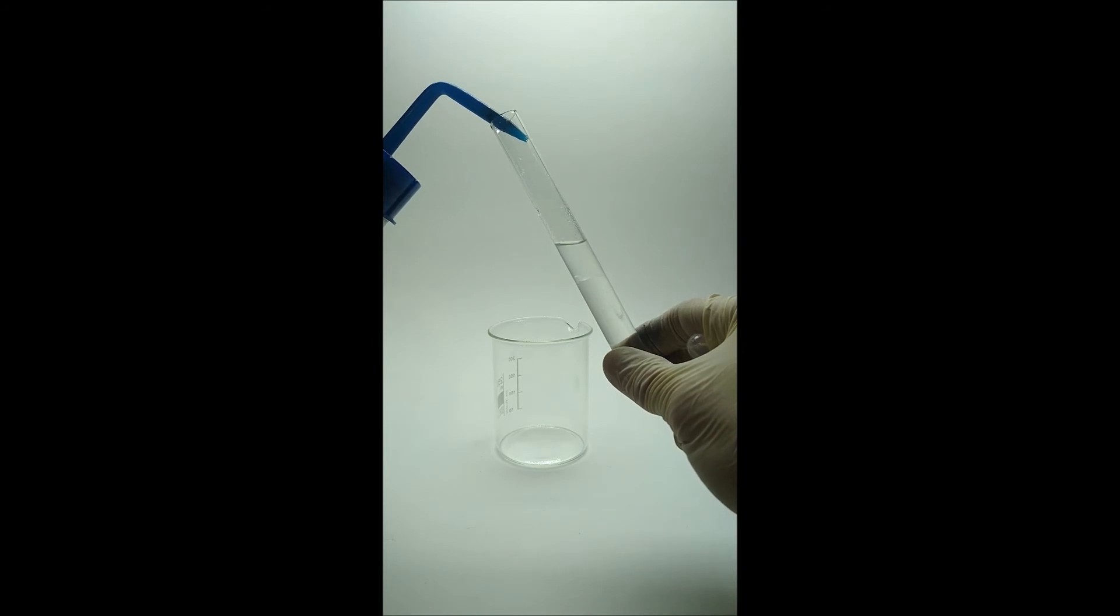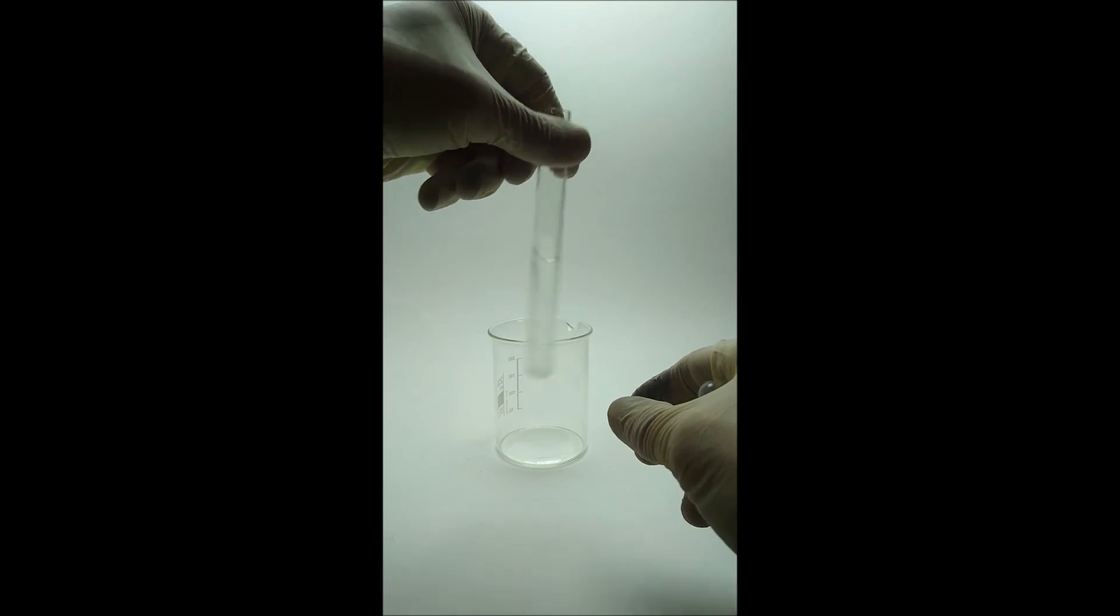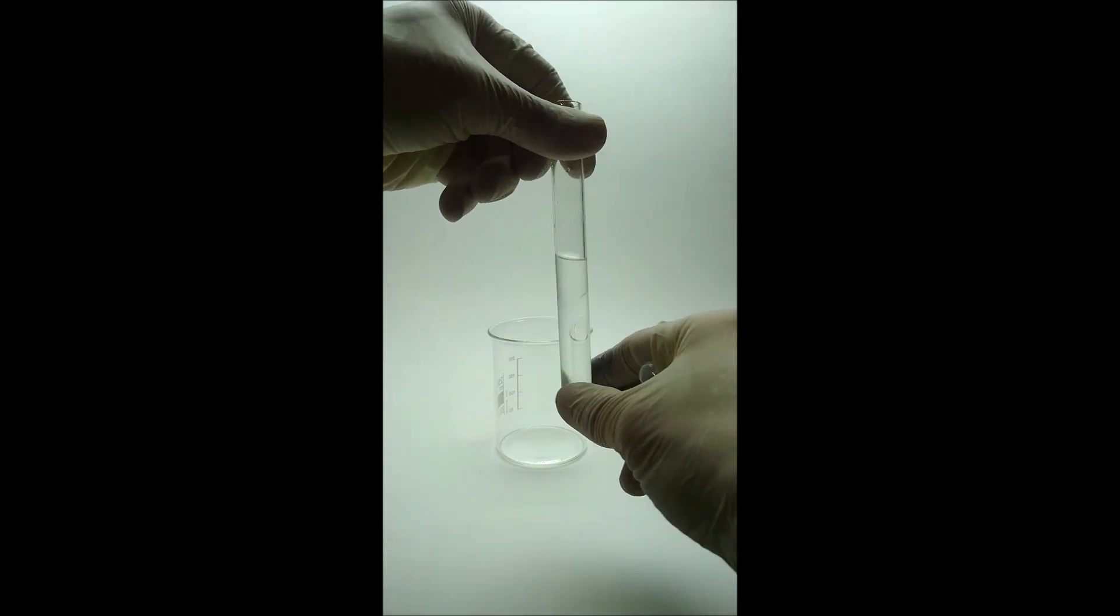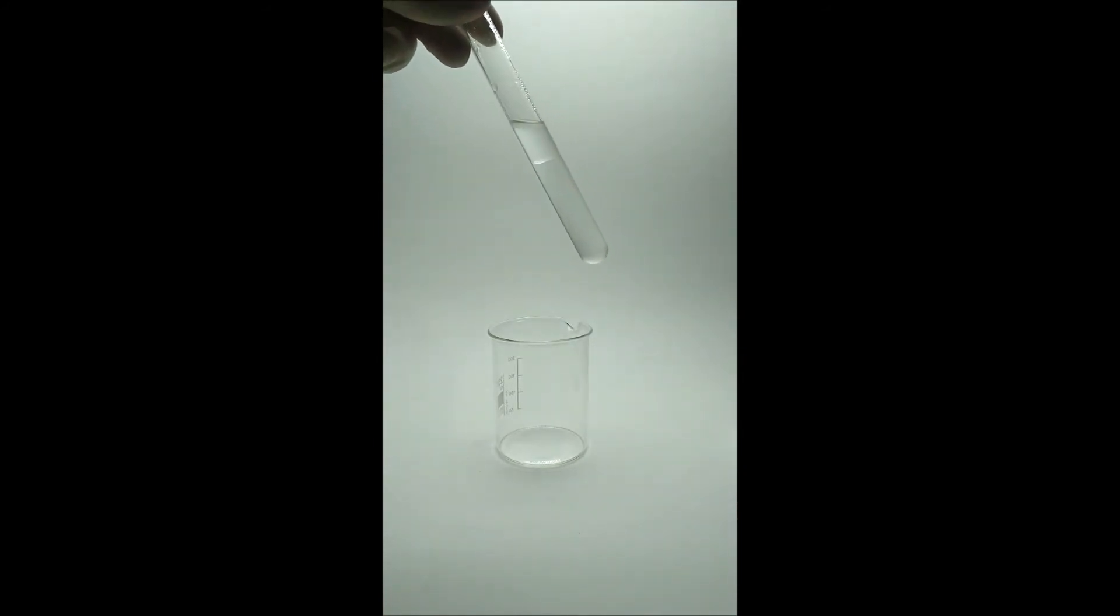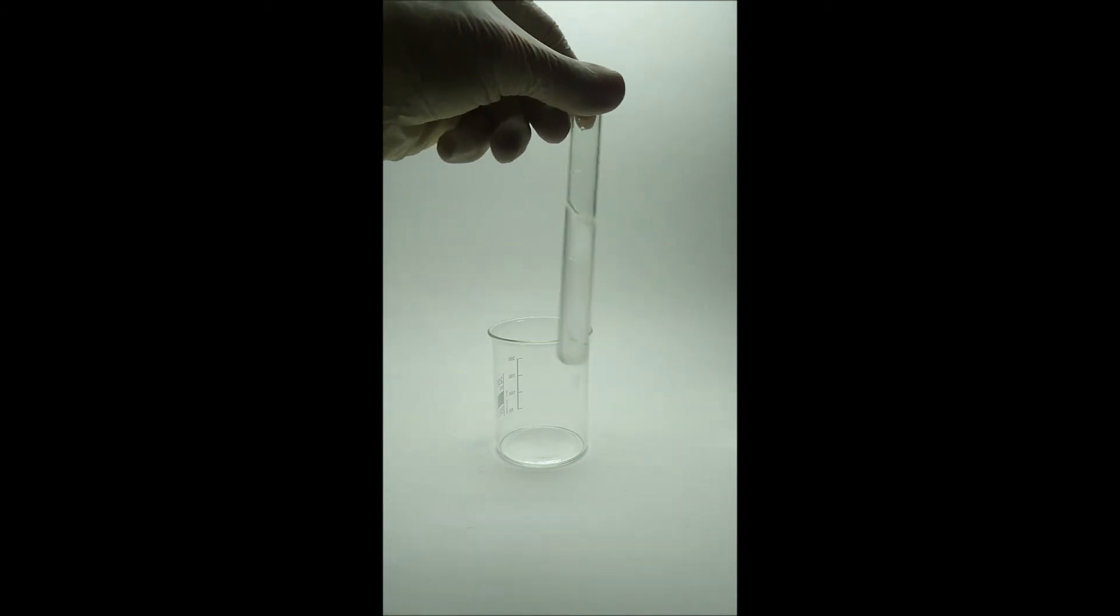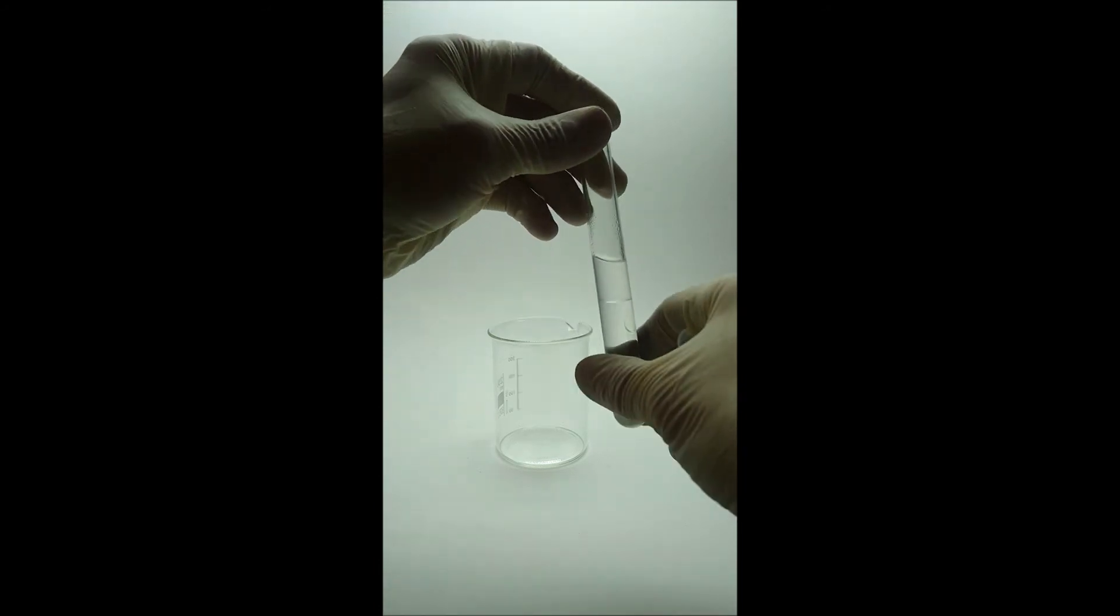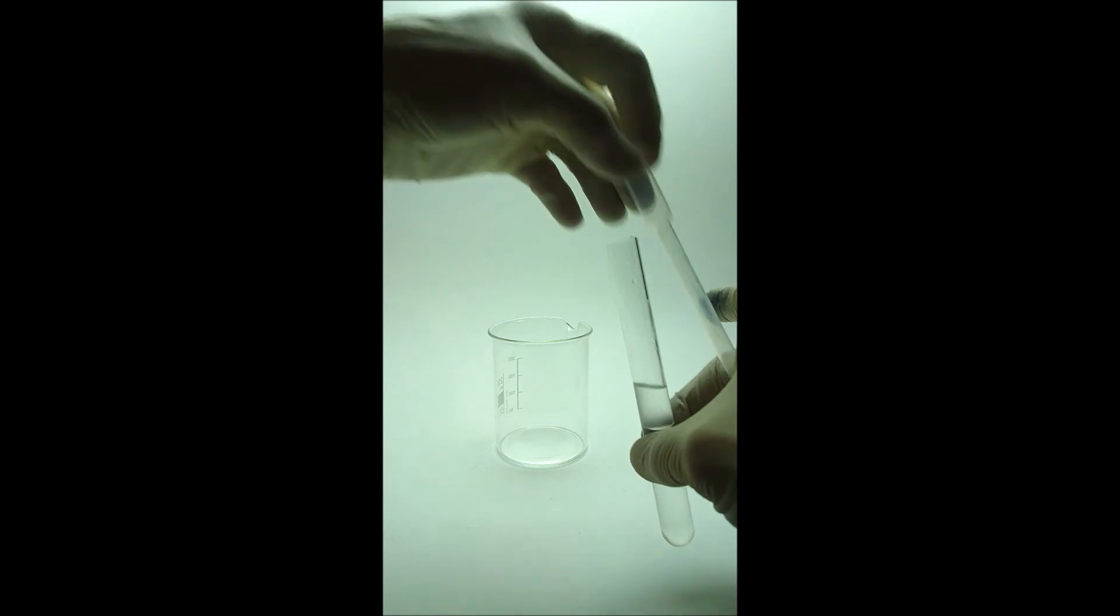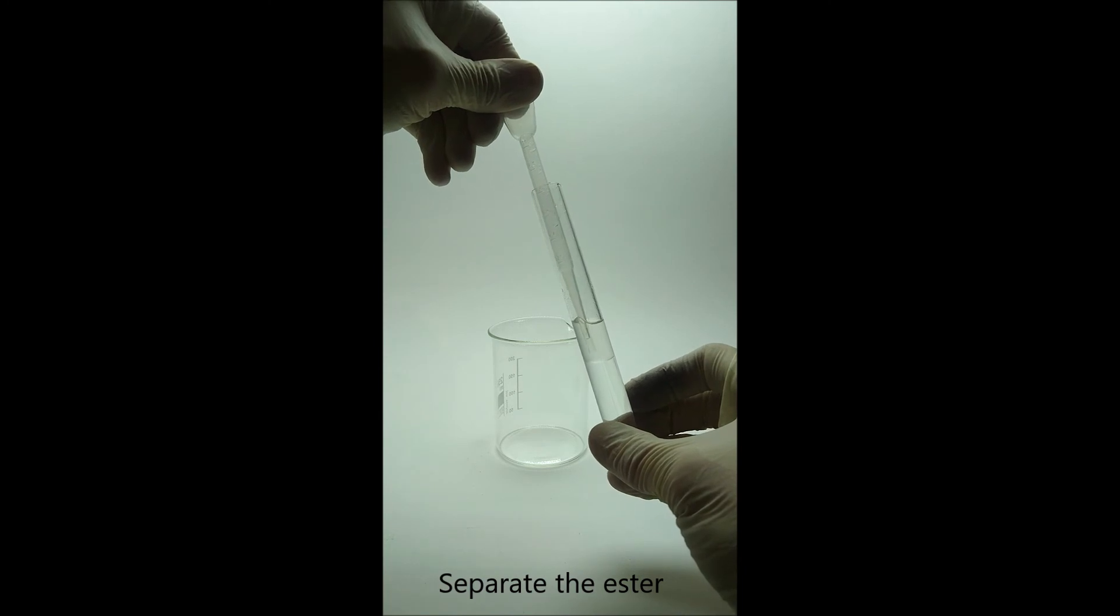So I'm just adding more water to be able to separate the upper layer well and to wash as much acid off the organic layer as possible. Now I'll just separate the organic layer to the beaker.